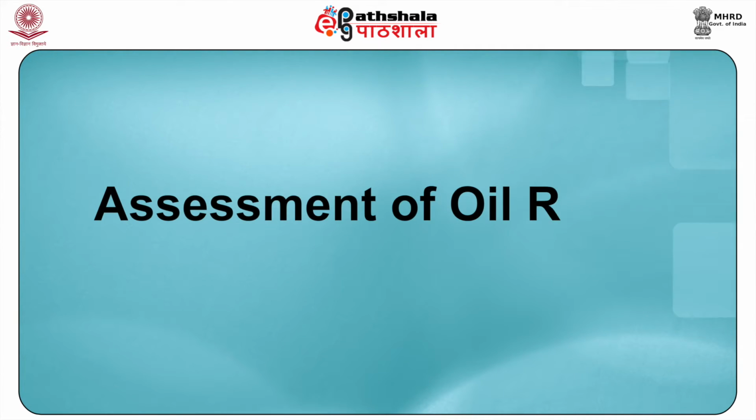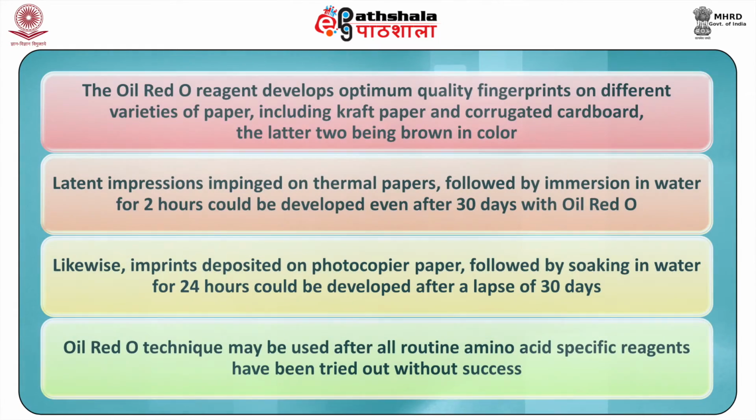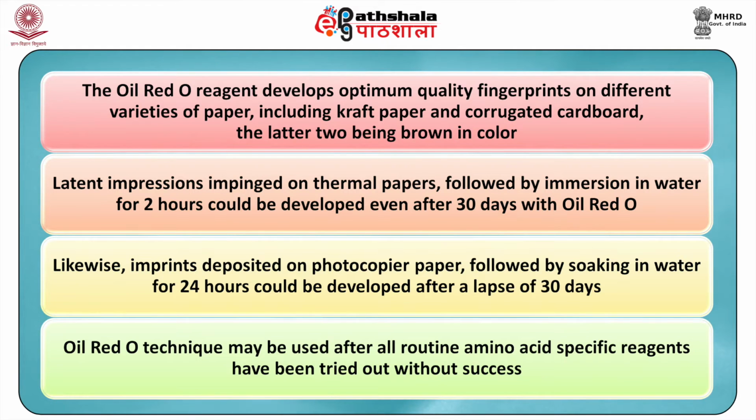Now let us have a look on assessment of oil red O method. The oil red O reagent develops optimum quality fingerprints on different varieties of paper, including craft paper and corrugated cardboard, the latter two being brown in color.